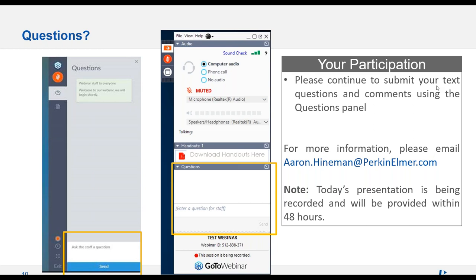Yeah. And the other advantage of the NexION, at least with the NexION P, is the quadrupole ion deflector, which means that all your ions are going through. My sensitivity over the Elan, and I can't speak about the 300s because I haven't really used them, Aaron, you might be able to answer that better than I, but from the Elan to the NexION was about a 5 to 10 times increase in sensitivity. On the 300s, actually, we were seeing that from the Elan to the NexION 300 when we went to the quadrupole deflector design, low mass was the biggest change, right?